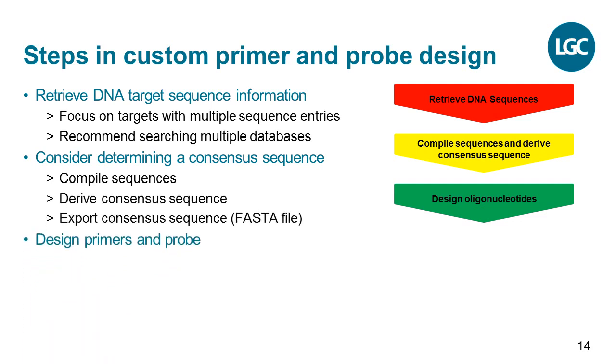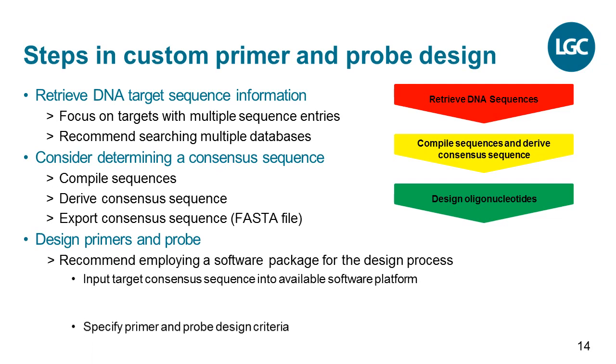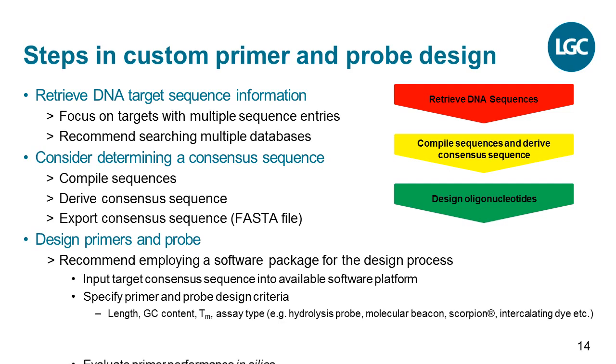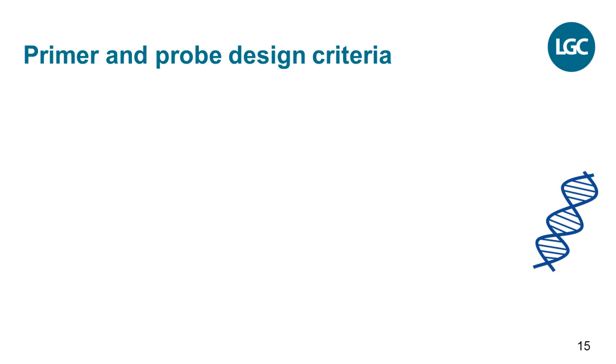The exported sequence can then be used in an appropriate software package to design primers and probes based on a number of design criteria that are described on the next slide. The slide illustrates the general criteria that should be applied when designing quantitative PCR primers and probes.